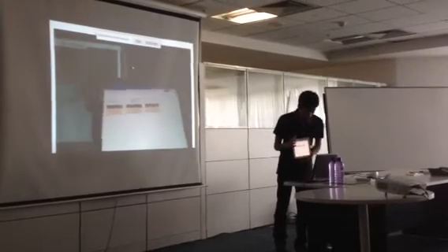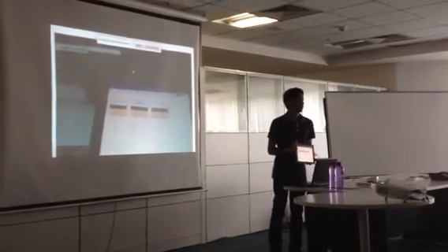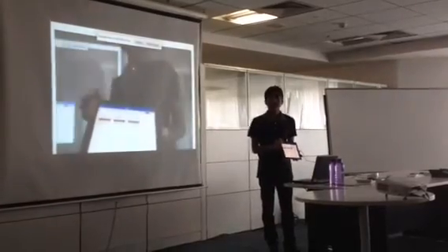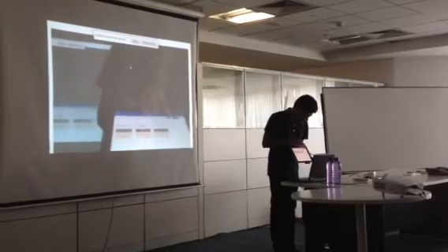The last tab is archived. The API calls for that have yet to be made, but that will basically be a search of all the patients, and it'll do a network search. So now we'll look at the reporting view.